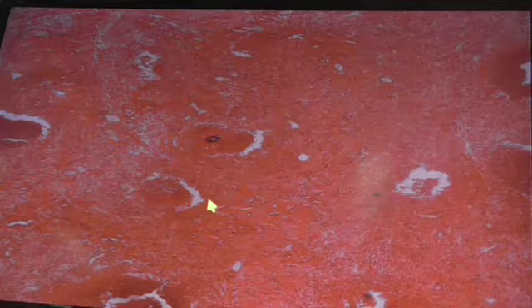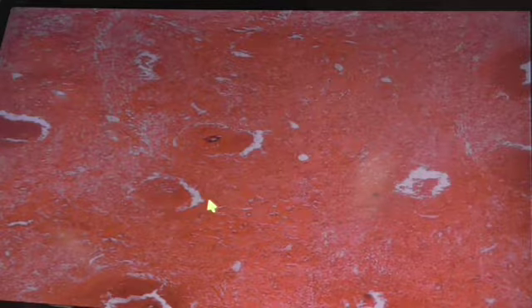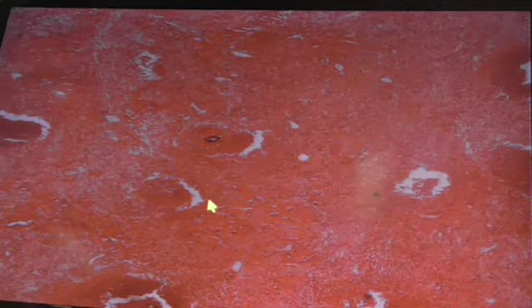I mean, the hair follicle I saw had a particular organism within it. What was the shape? It was elongated, kind of cigar shaped with legs. Short stumpy legs, those long extensions.